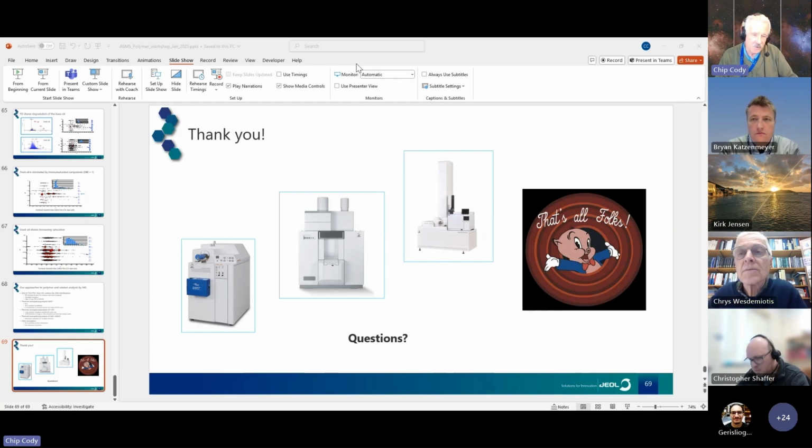There are other kinds of modulators. There are flow modulators. We were using the ZOX for years, but we recently switched to SEPSolve because they provide software control for flow and temperature during the GC run. We've been using multiple varieties of software. I was using GC Image for the structures you see. SpectralWorks UK makes Analyzer Pro XD, which is really versatile, especially for looking at multiple sample comparisons. And then, of course, our own software has the features for identifying unknown compounds and identifying known compounds with higher confidence.